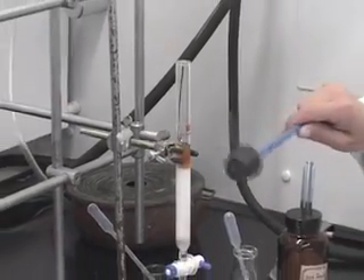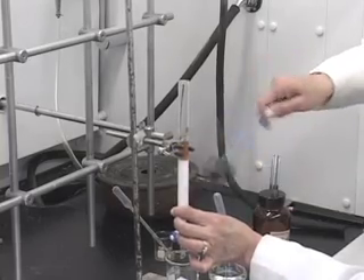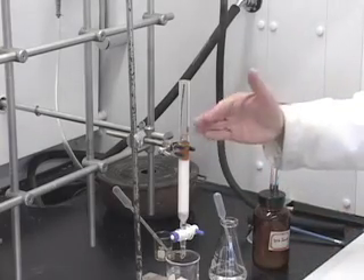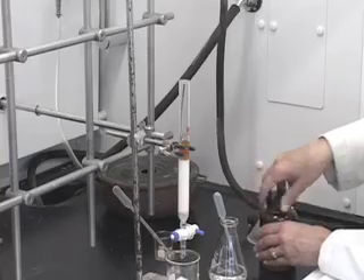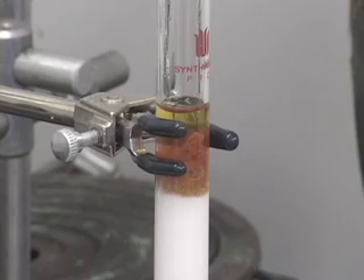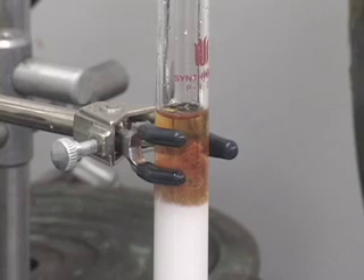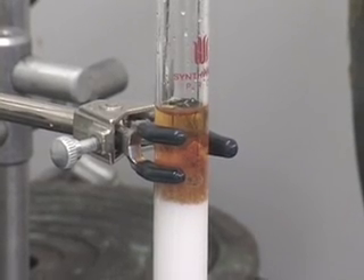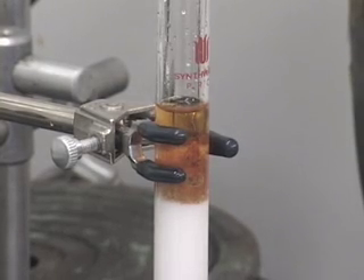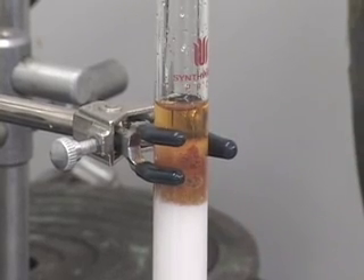Now we can gently tap it if you want. We also want to add some more sand on top of our sample — another layer, same reason — because our sample and alumina have a finer surface and we do not want any depression caused by solvent on top of that layer. So a third sand layer: first sand layer at the bottom, second above alumina, third above our sample.